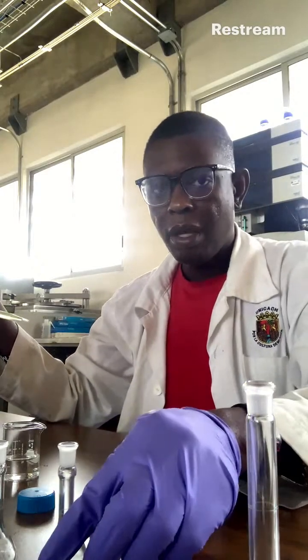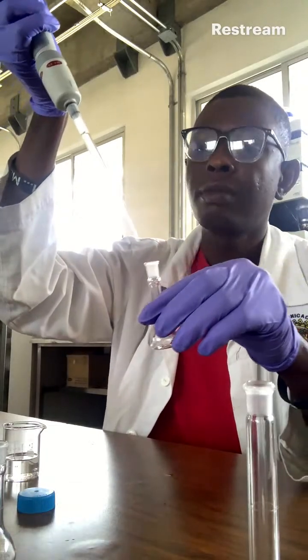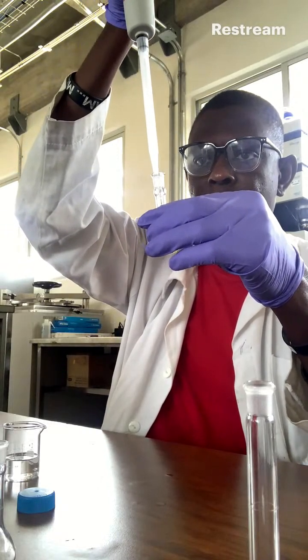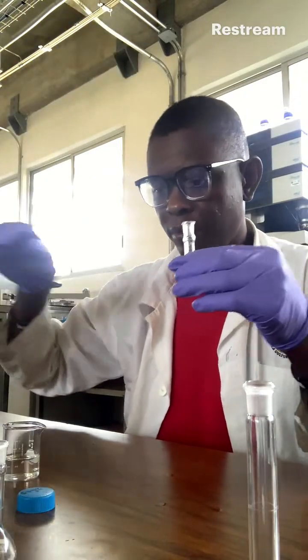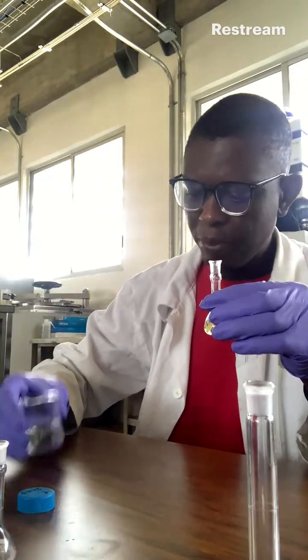So I will pour it into this can. Now next, I will dilute it with isopropanol.